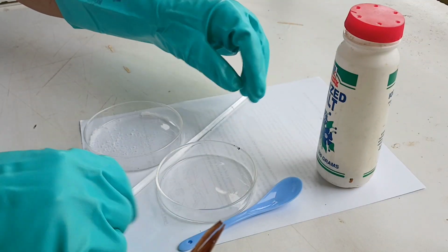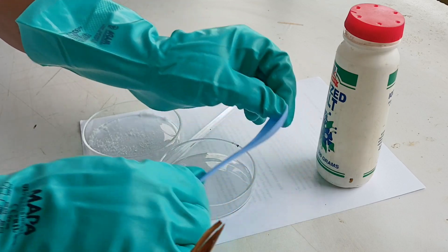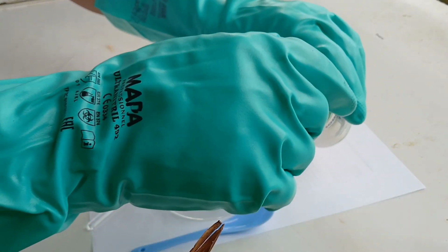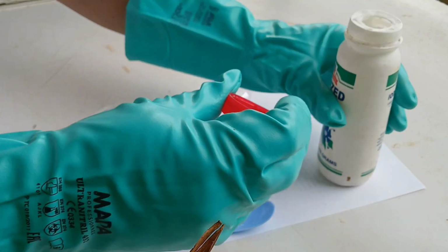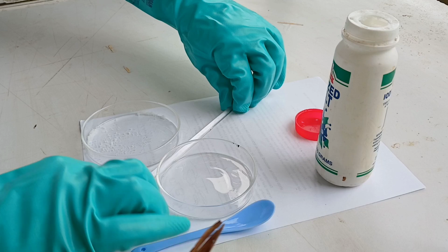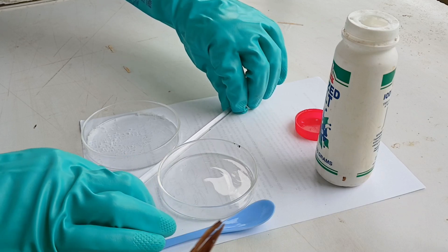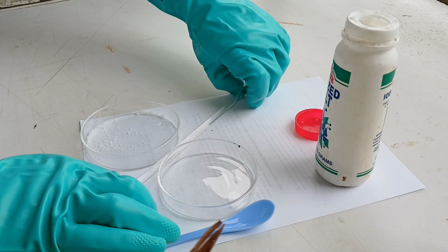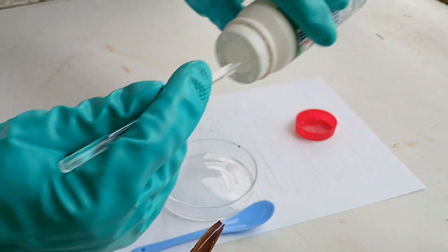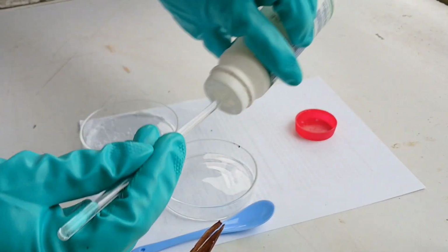Today, atong Sugilanon karon is to tell you how to handle solid and liquid chemicals. If you can see in the video, nagsugod na siya. Yes, you have the container. You just open the lid of the container and put that on the table in an upside down position. So when you say upside down, nakahayang ang taklob, okay?